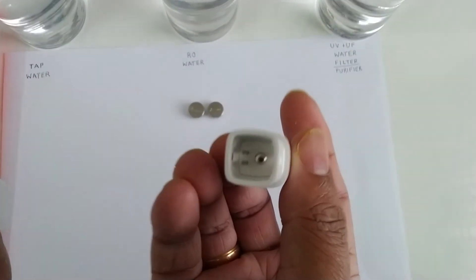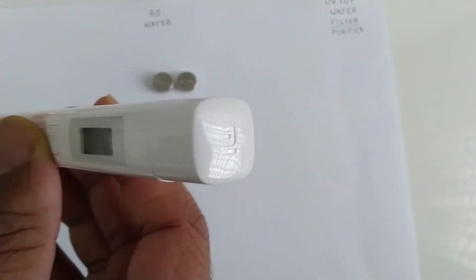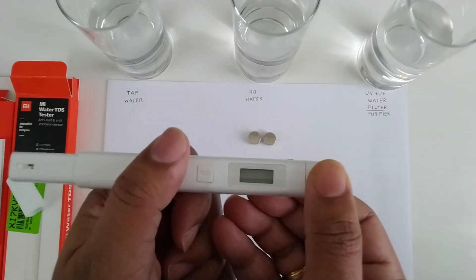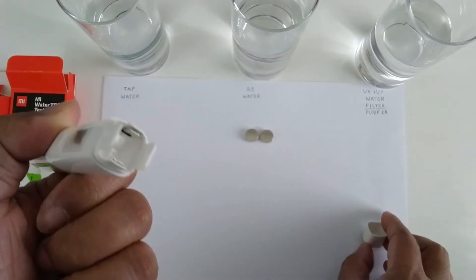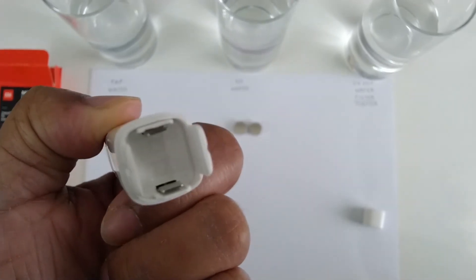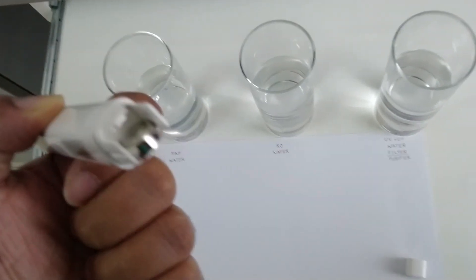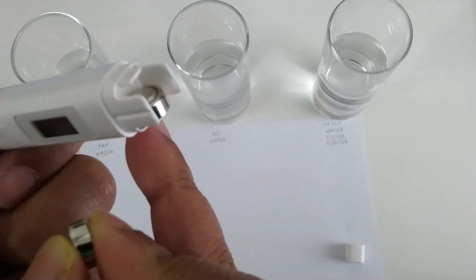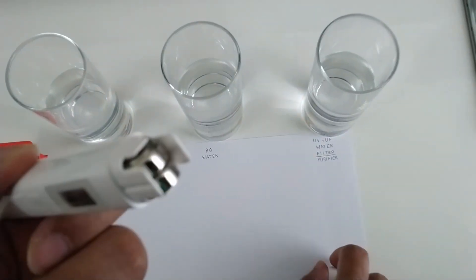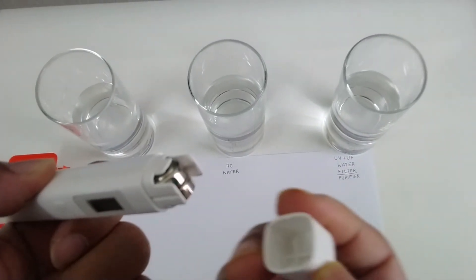This is the sensor side. Let's see how we can insert the battery — you have to remove this cover. As you can see, you insert the battery with the plus side marked here. Both batteries are inside and we close the cap.